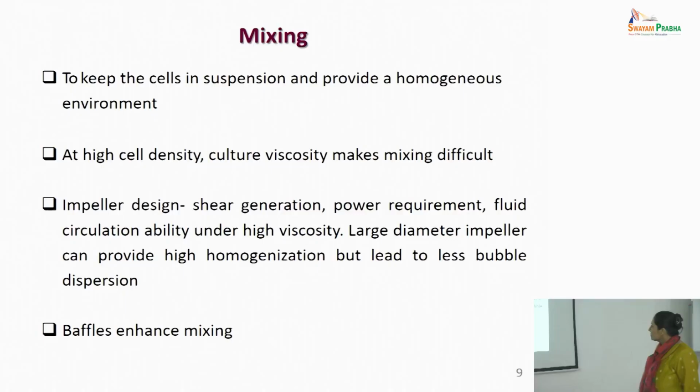So what was the learning lesson? That maybe in the CFD model which we have developed, in the first hand itself, you anticipate this and see how keeping two impellers at a certain distance on the shaft can improve the hydrodynamics, or, if not improved, at least through the hybrid model, reproduce the same results as shake flask.